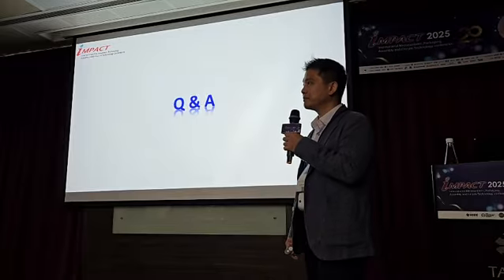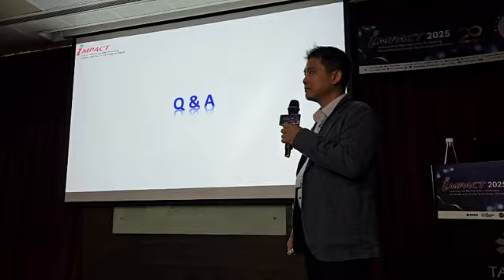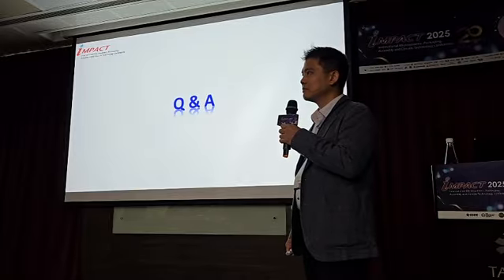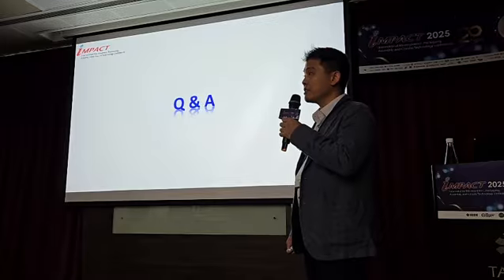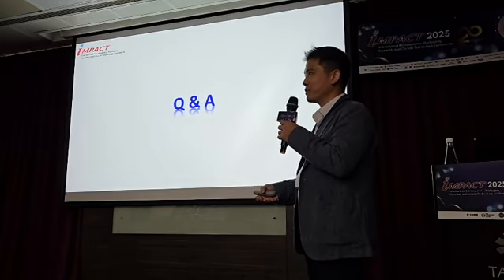Question: In terms of spatial resolution, is it possible to make a measurement of a micro crack resulting from some contamination? Well, if the crack is air, then of course there's no IR signature we can generate from the opening.